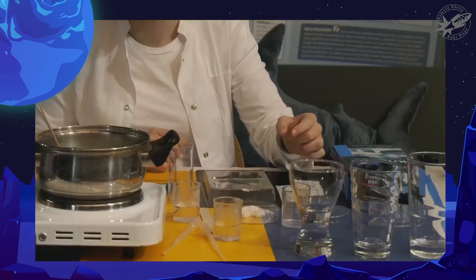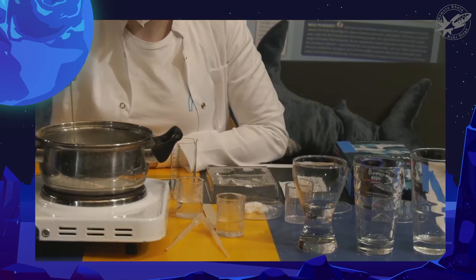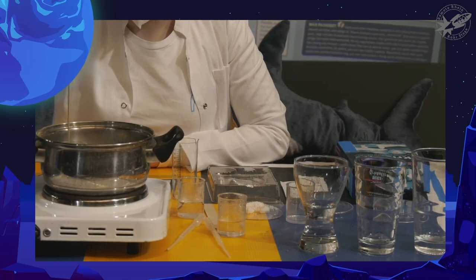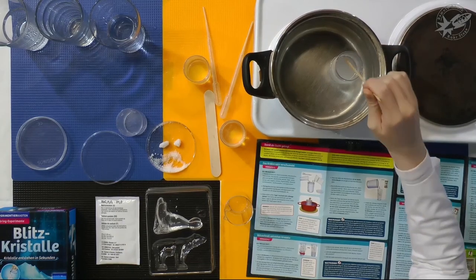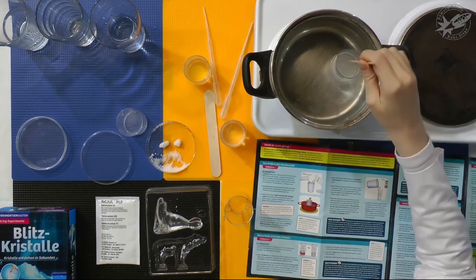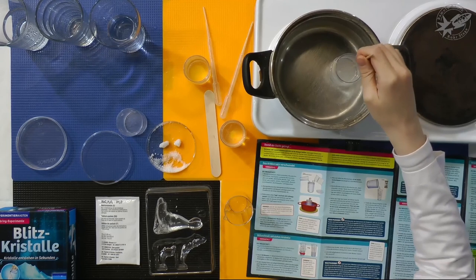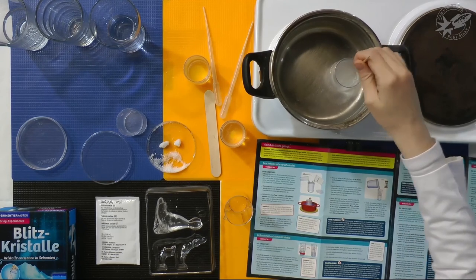Hoffe ich zumindest, dass man sieht. Also ich sehe das. You can see that the rest from previous experiment is no longer clear. Man muss noch ein bisschen rühren. At least it's obvious to me. I'm not sure if it's obvious to the audience there. Here I will need to stir a little bit more. Ja, dieses Experiment braucht ein bisschen Zeit.